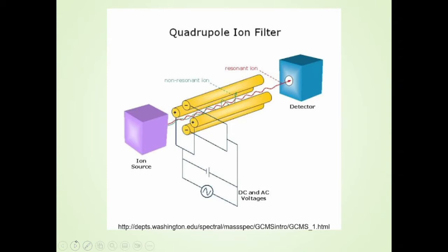And basically, the column is going right into the ion source. This ionizes a sample that comes in. We have some charged metal plates, so when you have a charged species, when you have an ion, it has a positive charge. If we put a positive potential on that metal plate, it pushes it out into this thing called a quadrupole filter. And it actually is 4 metal poles.